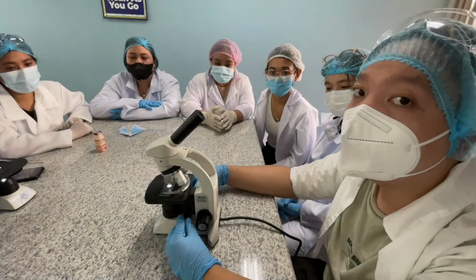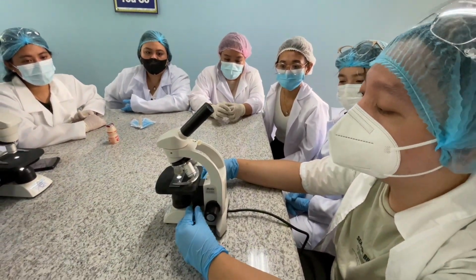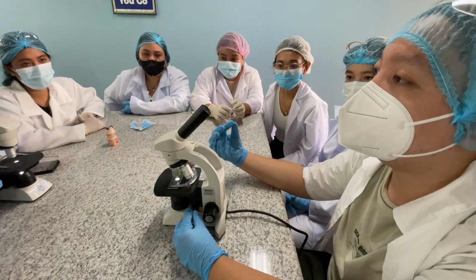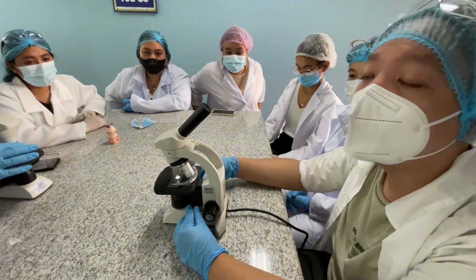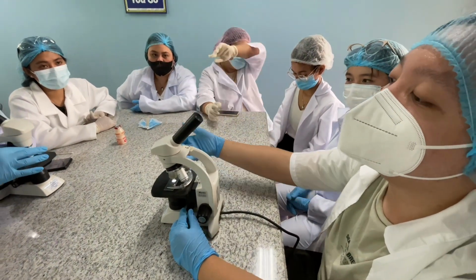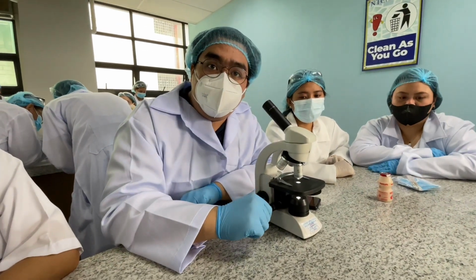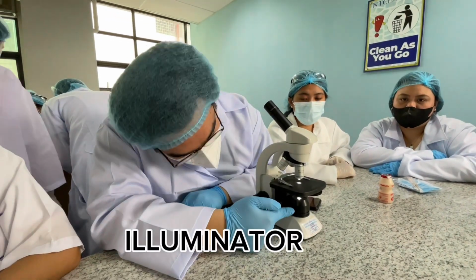Now, lastly, we have here our fine focus. Fine focus is for us to get a much better magnification and clarity doon sa ating mga lenses. And of course, hindi mawawala ang microscope kung wala ang ating last main component of a microscope, called the illuminator.